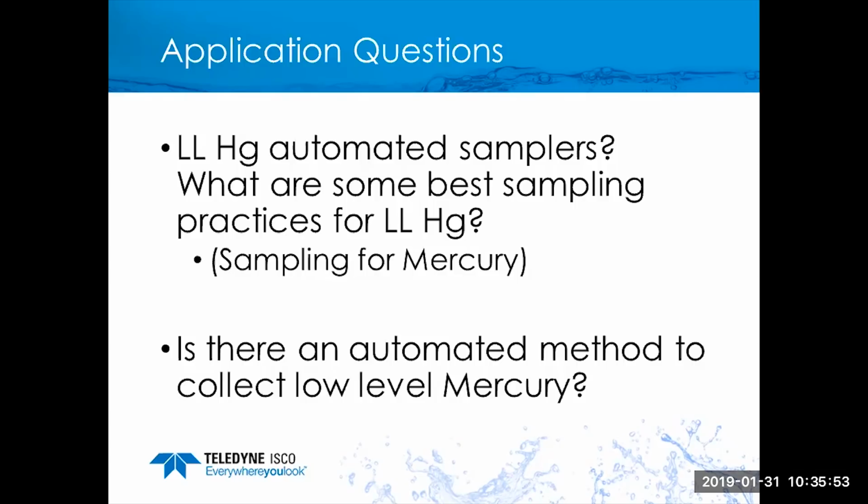that are in the sample transport. That means the intake line, the strainer. First of all, the strainer, you would want to utilize a strainer that is no metal whatsoever. Any tubing couplings that you have to join the suction line to the pump tube, you would want to use a non-metal material. In some samplers, we have a bulkhead fitting that feeds the sample into the compartment where the bottle is located at. That may be a stainless steel. You would want to remove that and switch that over to a non-metal material.